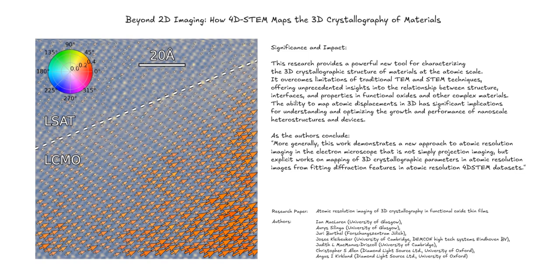We'll be looking at the article Atomic Resolution Imaging of 3D Crystallography in Functional Oxide Thin Films by McLaren et al. This paper describes a technique allowing us to see and understand how atoms are arranged in 3D space within thin films. Thin films are crucial in many advanced technologies.